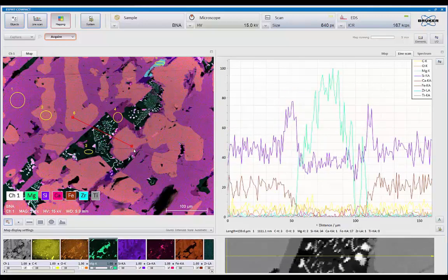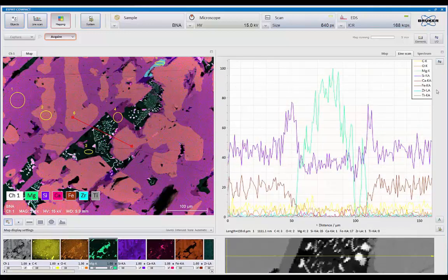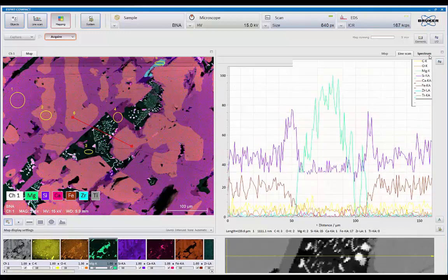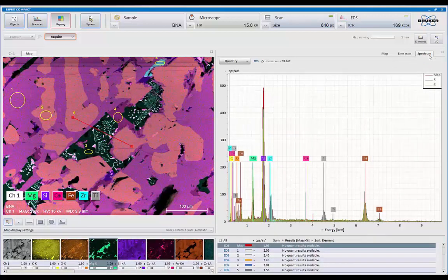And again, this is all still alive. We're still collecting data. In fact, you can just see it update right there. I do not have to stop the analysis to do any of these processings.